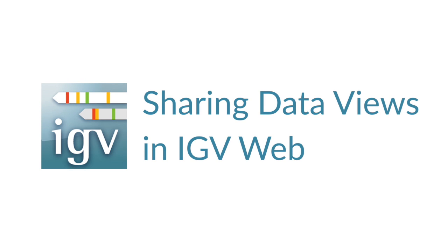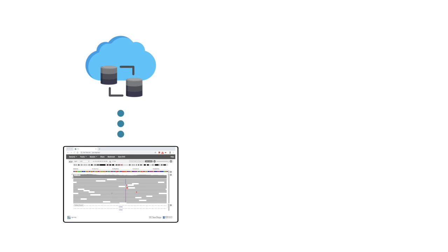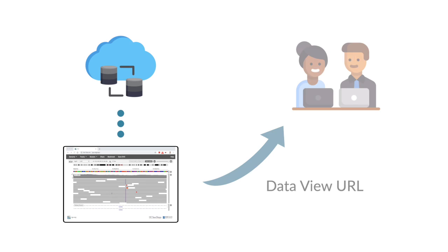In this video, I'm going to show you how to share interactive data views in the IGV web app. Sharing data views in the IGV web app is easy. If your data is available online, sharing a view of that data is as simple as sending a URL to an IGV web app session.